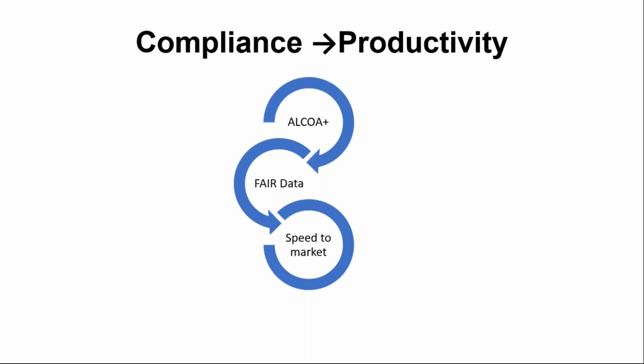So having the compliance in place for recording of data or for all of the lab processes doesn't reduce the productivity, but it actually helps to build good data which can be utilized by the scientists to understand the product in a better way.